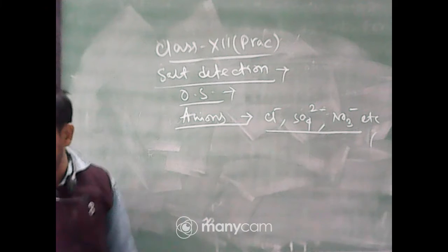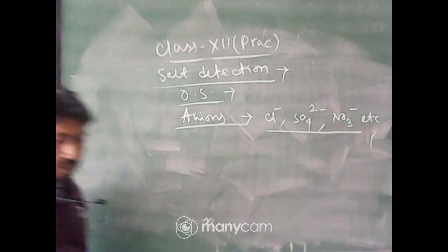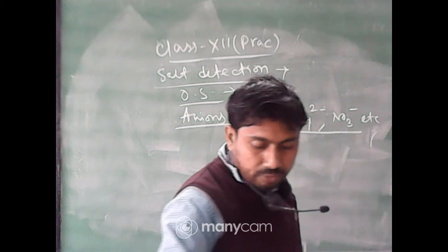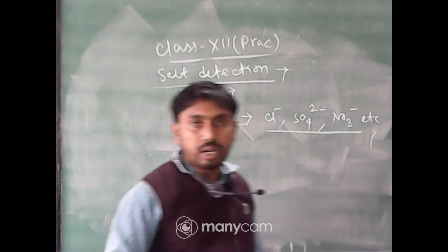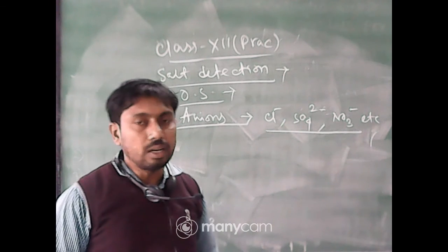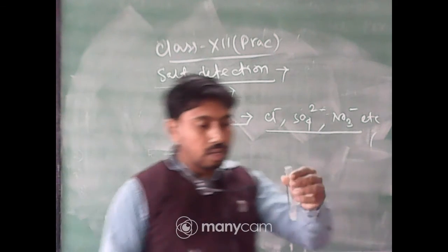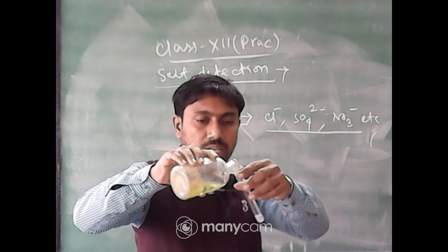Now the specific reagent. Potassium ferrocyanide is a reagent used to test zinc, and if you add potassium ferrocyanide directly to the zinc solution, then it gives the PPT, which is coming now. Okay. So next I will show you the direct test with the original solution.